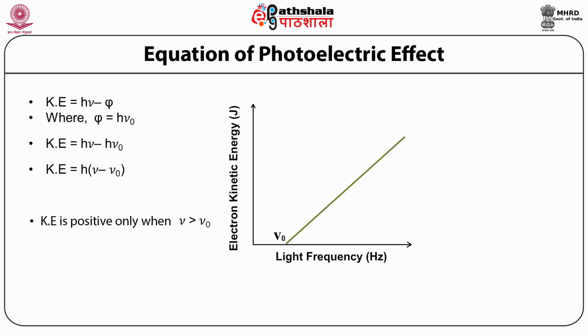And if the frequency is low enough, then none of the photons will have enough energy to knock an electron out of an atom. So, if you use really low frequency light, you shouldn't get any electrons, no matter how high the intensity is. Whereas, if you use a high frequency, you should still knock out some electrons even if the intensity is very low.